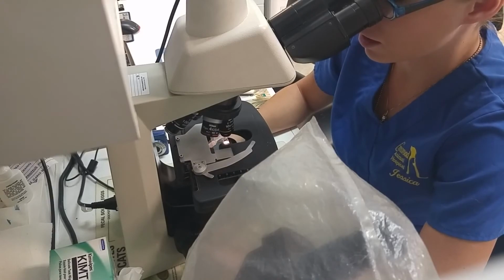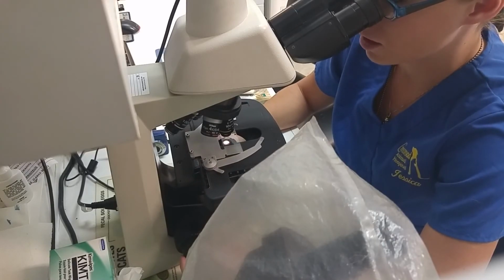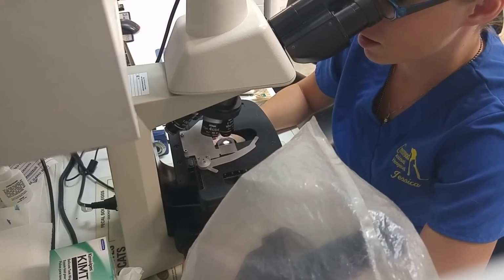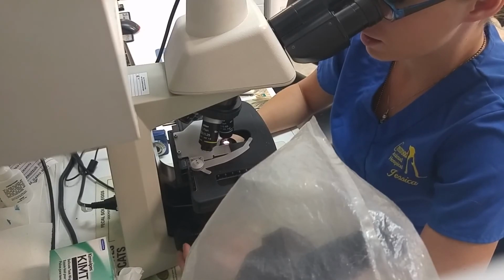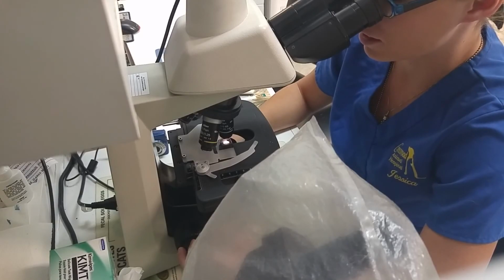At this power, we're not going to really see a good evaluation of yeast and bacteria. We'll go up one more here in just a minute. Right now, I'm just seeing blood cells and some clumps of hair. Nothing else of significance. Again, there's going to be a normal flora of bacteria and yeast, but if we were to see an overwhelming amount, then that would indicate some type of infection that we would need to address.